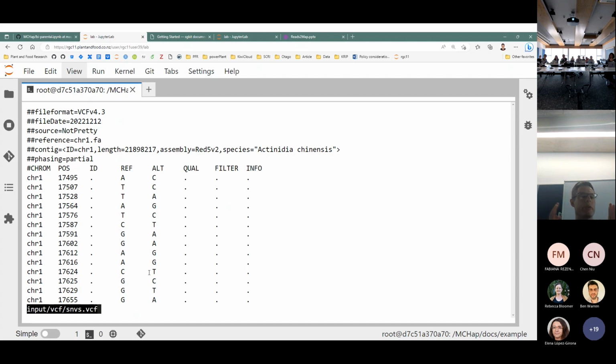So you can reuse a VCF file from anything for as long as it's using the same reference genome, but it makes sense to produce a VCF file that is relevant to your current data set. Typically, I would do some initial SNP calling using something like GATK or Freebayes, produce a VCF of SNPs that way, and then use those to assemble the data set. So you're doing multiple phases of your analysis: one to get your SNPs, the second one to assemble those SNPs into haplotypes.